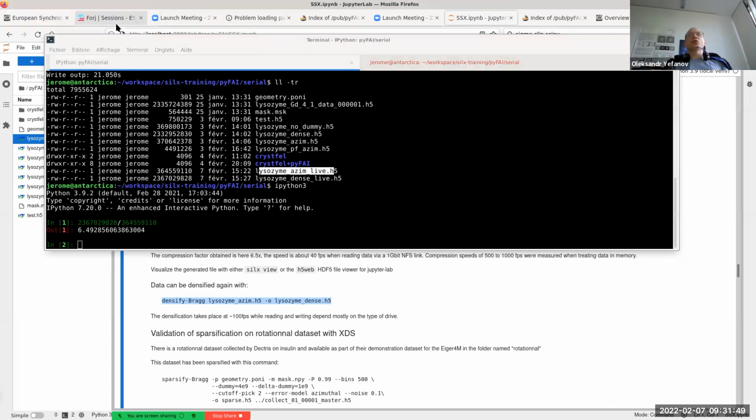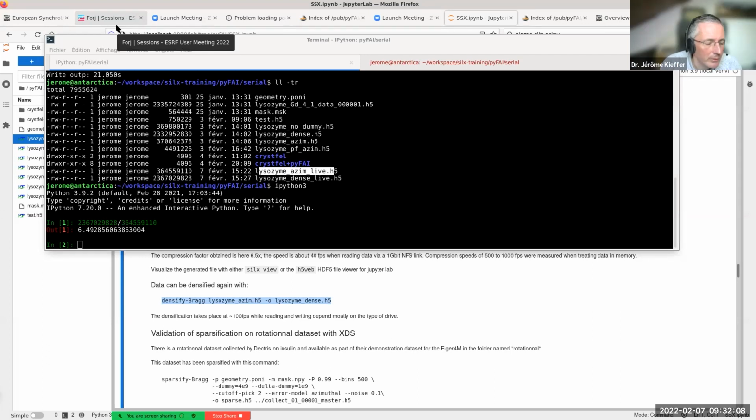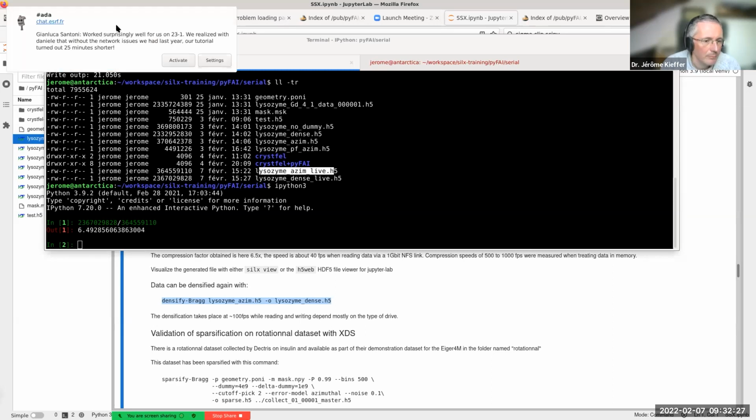So the geometry of the Jungfrau detector, how did you make this one? Sorry? The geometry of Jungfrau. You have these 8 panels and you need to know where they are. From the image on the website, it looks like there's either a Z offset or inclination. So how do you make the geometry? For the geometry itself, first of all, we did not yet characterize it precisely. So we have pixels located, let's say, within 75 micron. We have just a rough approximation of where the pixels are. And then we need, of course, to characterize them.